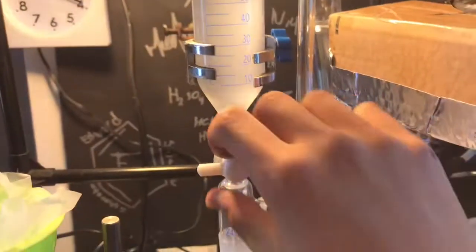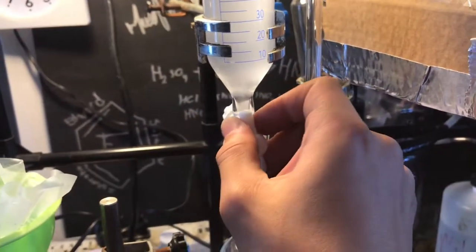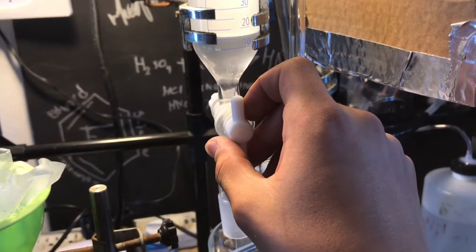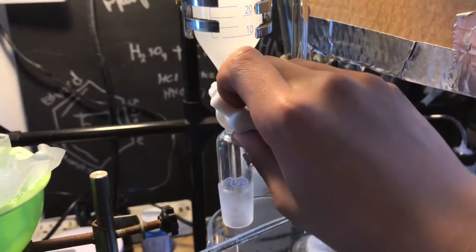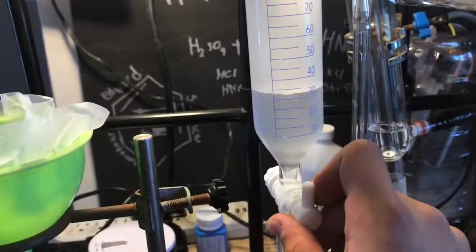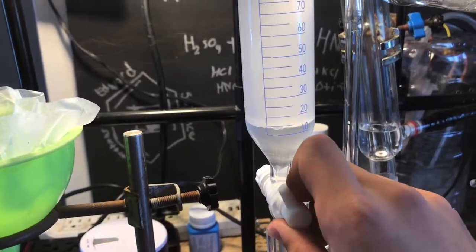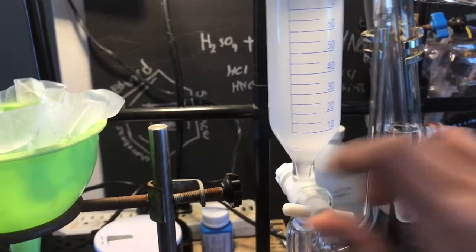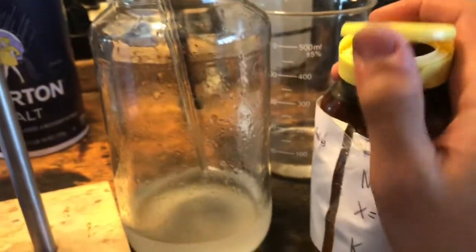I'm adding it to a separatory funnel — well, I'm using an addition funnel, but same thing basically. Separate it off, and the xylene is the top layer, and the water and acetone is the lower layer. You can recover the acetone if you want, but it's sort of pointless. My separatory funnel wasn't large enough, so I had to do it multiple times.